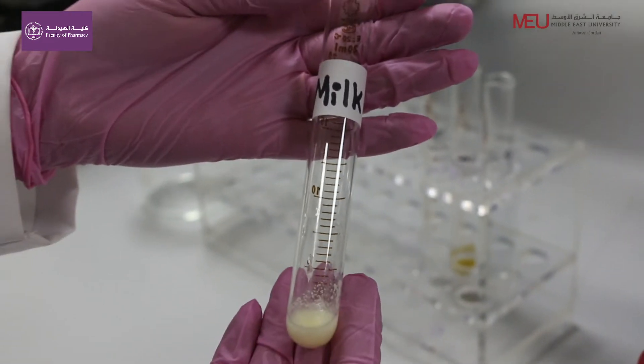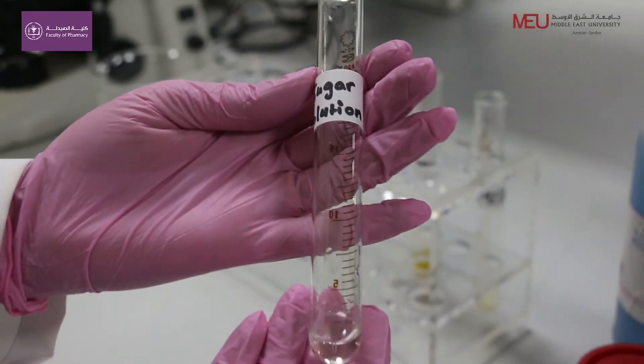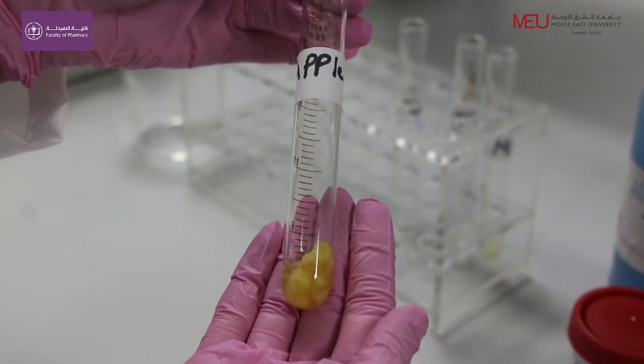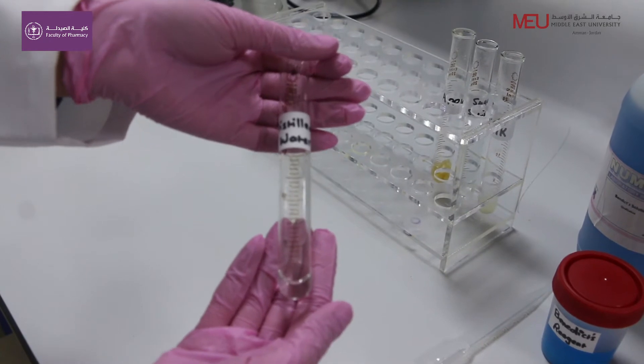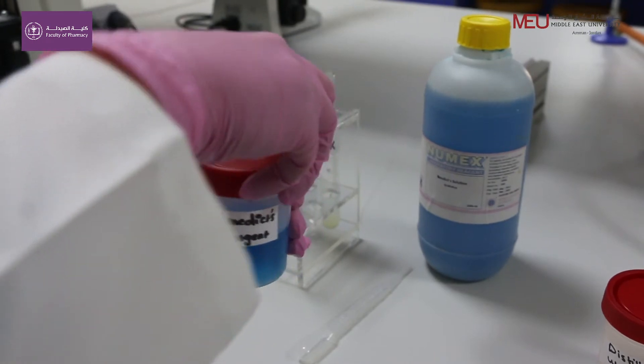In each test tube place 1 ml sugar solution, a piece of fruit with some water, and 1 ml distilled water. Add an equal amount of Benedict's solution to each test tube.